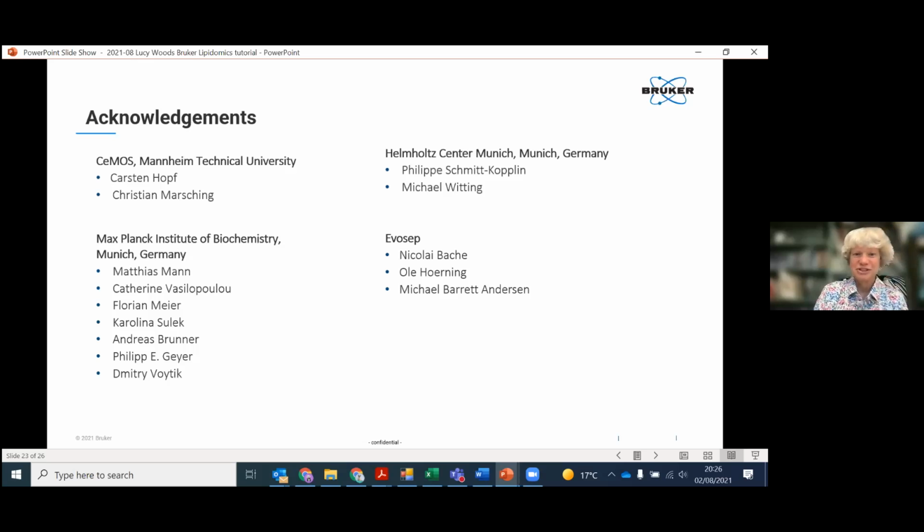Great, thank you very much. Let's see, we do have a question in the chat from Siju. Someone in the morning asked if you can calculate FDR for a lipid annotation. Can you share your thoughts?